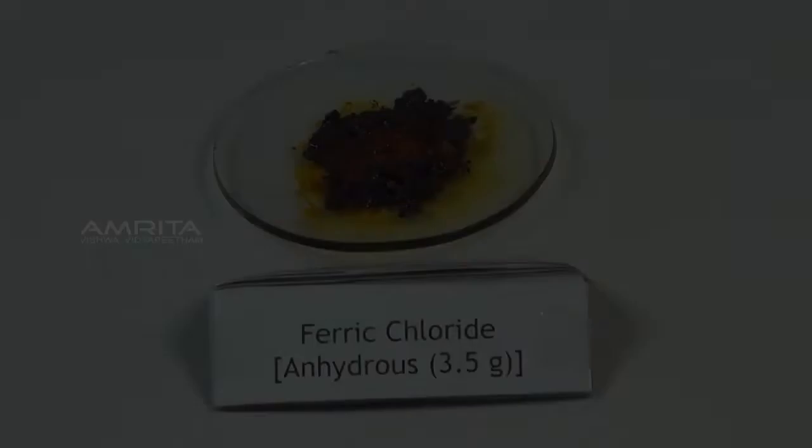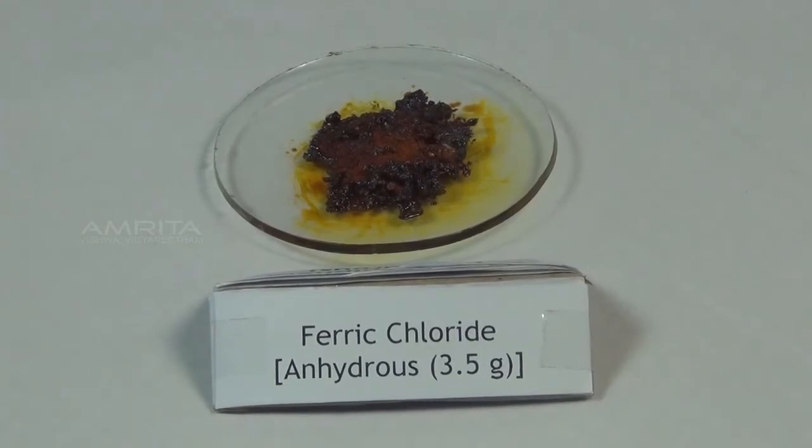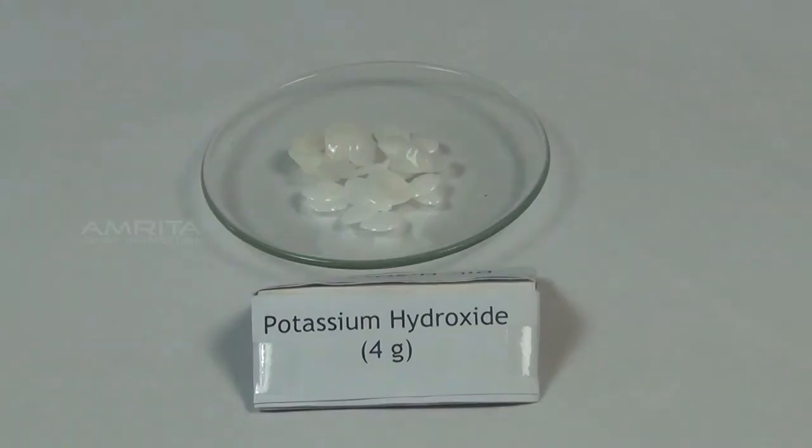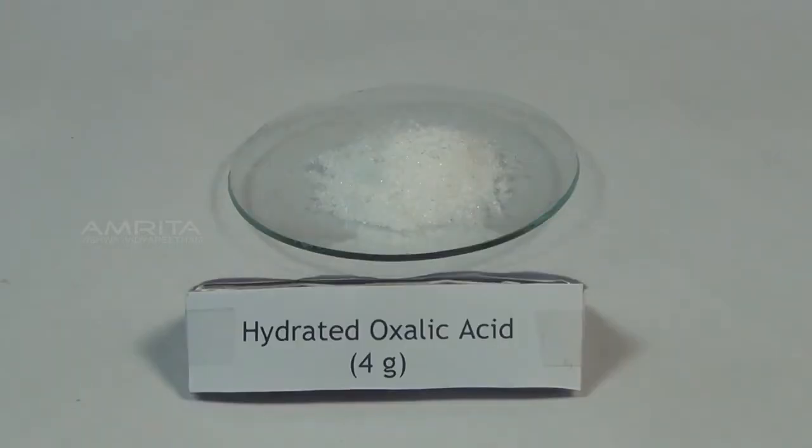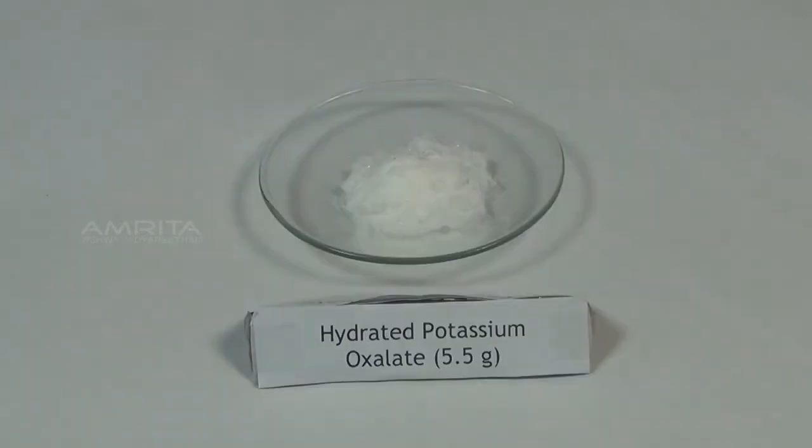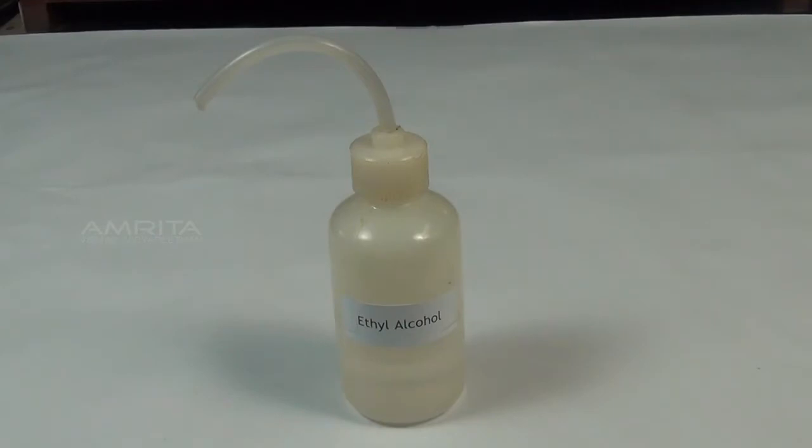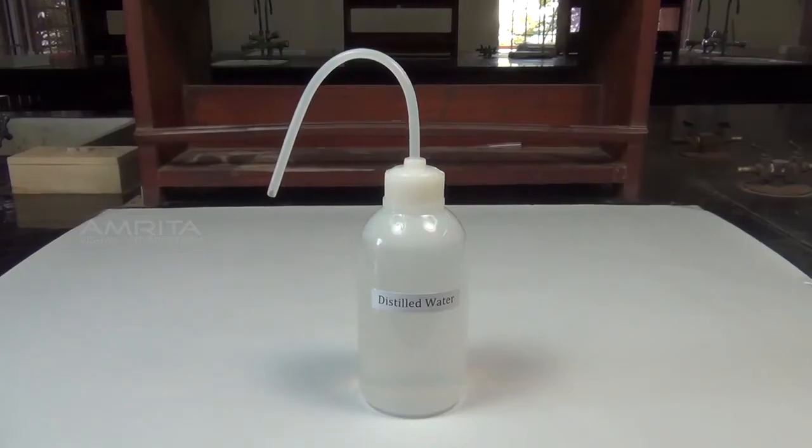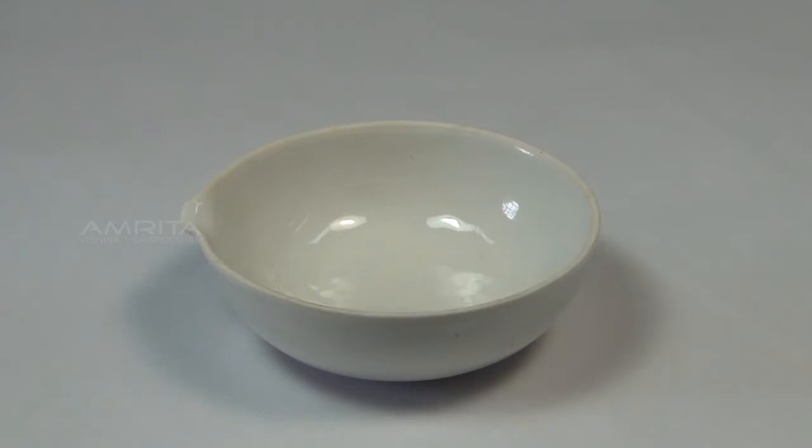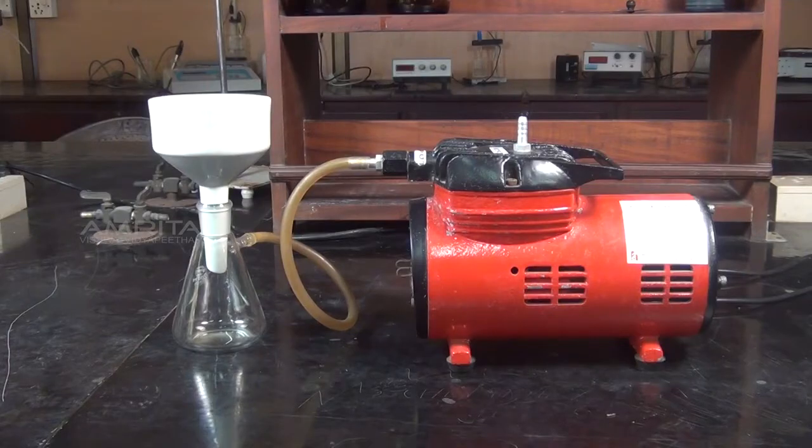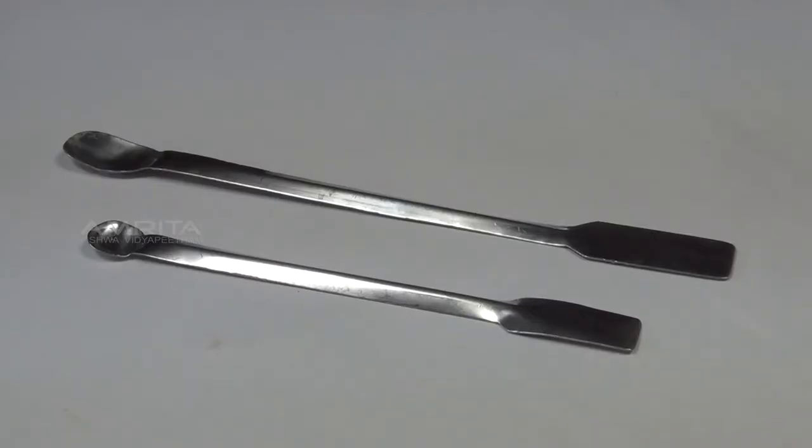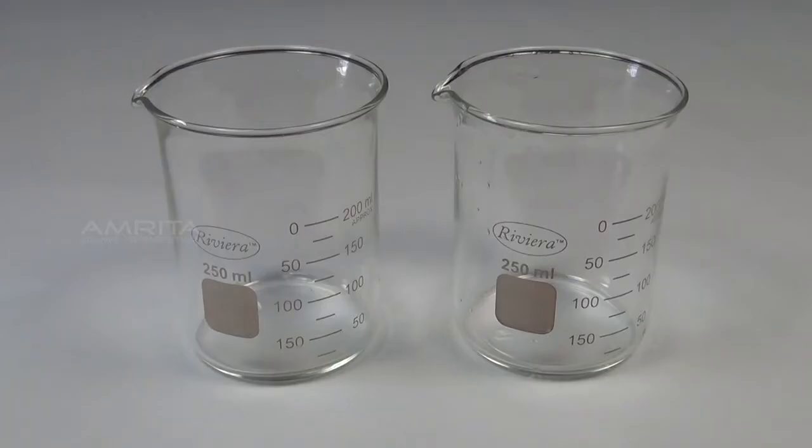Materials Required: 3.5 g anhydrous ferric chloride, 4 g potassium hydroxide, 4 g hydrated oxalic acid, 5.5 g hydrated potassium oxalate, ethyl alcohol, distilled water, cold water, china dish, Buchner funnel, spatula, glass rod, beakers, measuring jars, trough, watch glass, filter papers, black paper, sand bath.